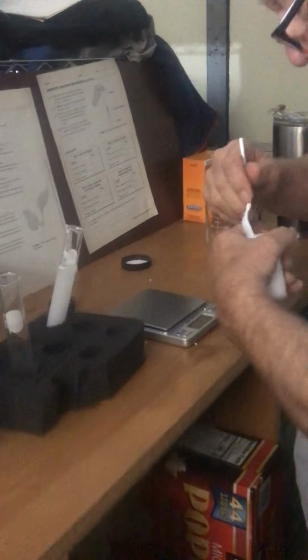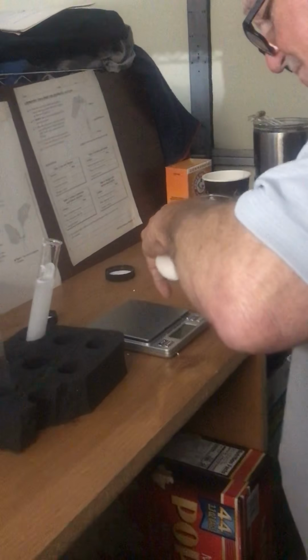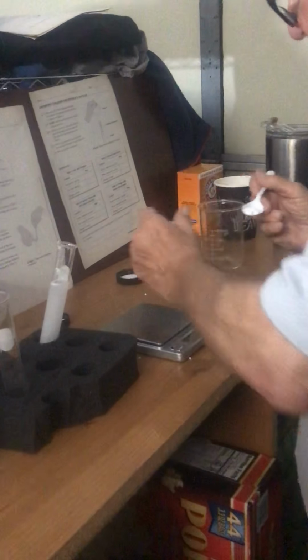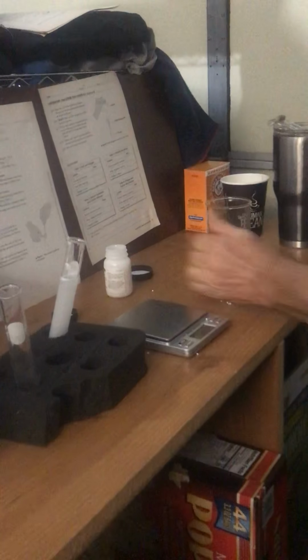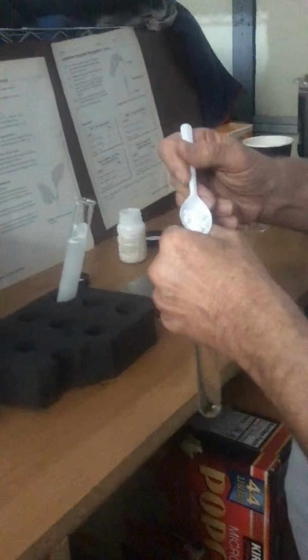Oh my gosh, I did it again. I'll have to clean that up. Okay, so that's about half. Scrape the other part of it in here. Okay, so I'm going to put that one in here. A lot easier on that one.